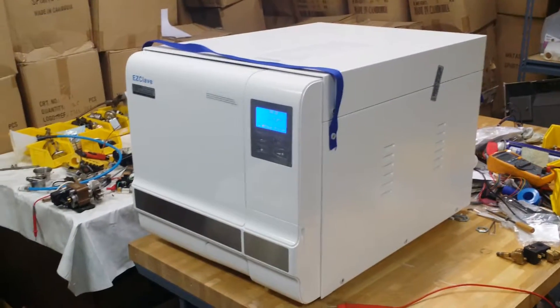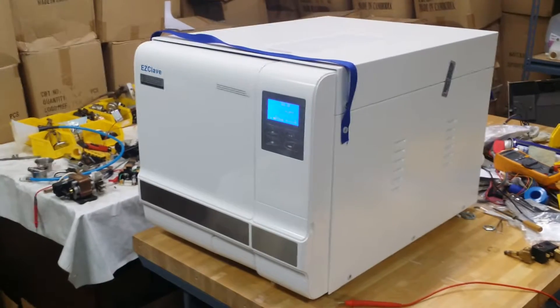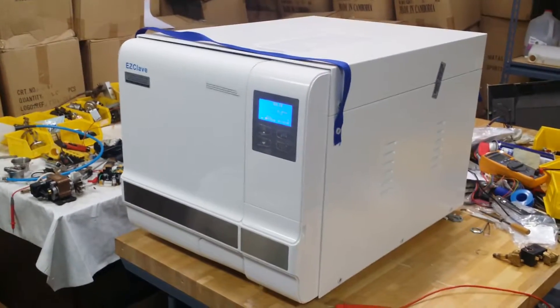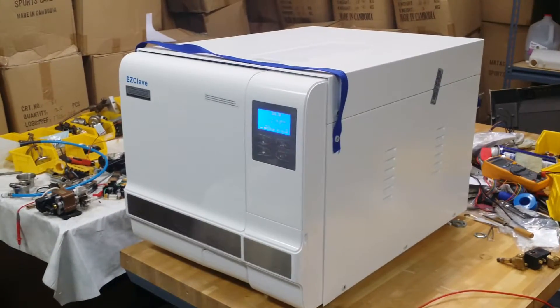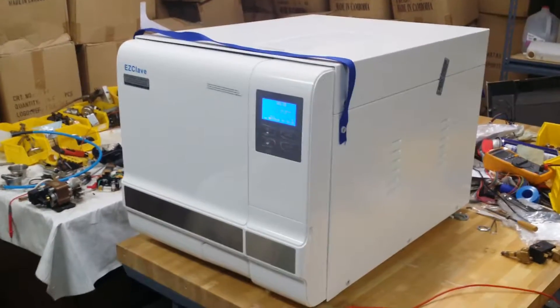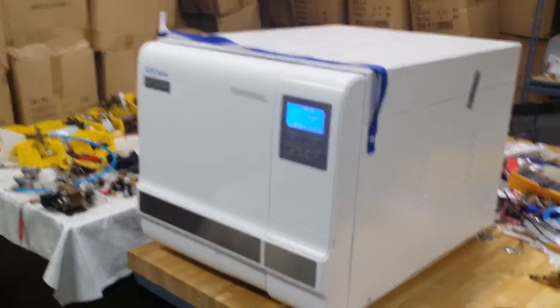Hello, good afternoon. My name is James. This video will show you one of the best tabletop sterilizers for lab applications — for schools, universities, and any kind of laboratory. This sterilizer is fully automatic.